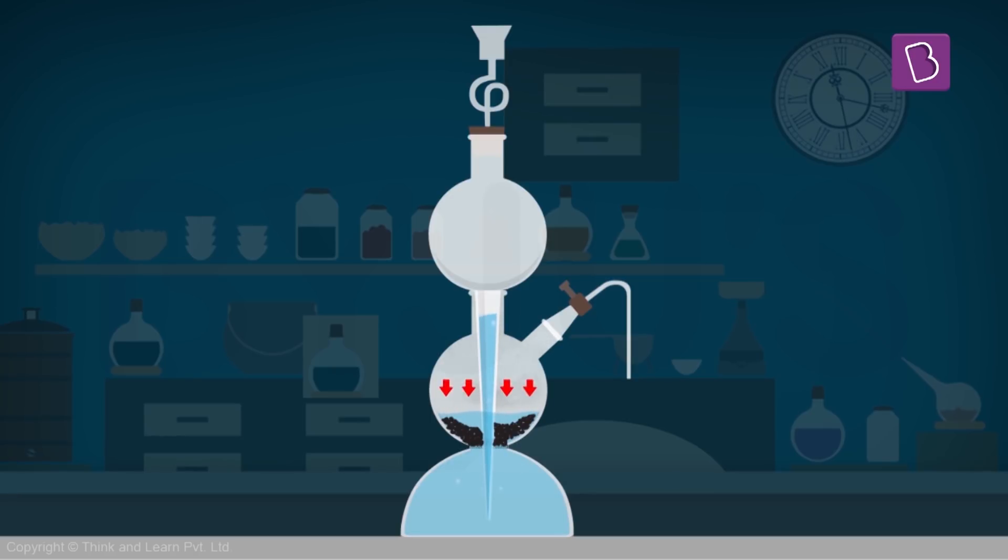on H2SO4. The liquid gets pushed out. There's nowhere to go, so it retreats into the third and last globule with the flat end.